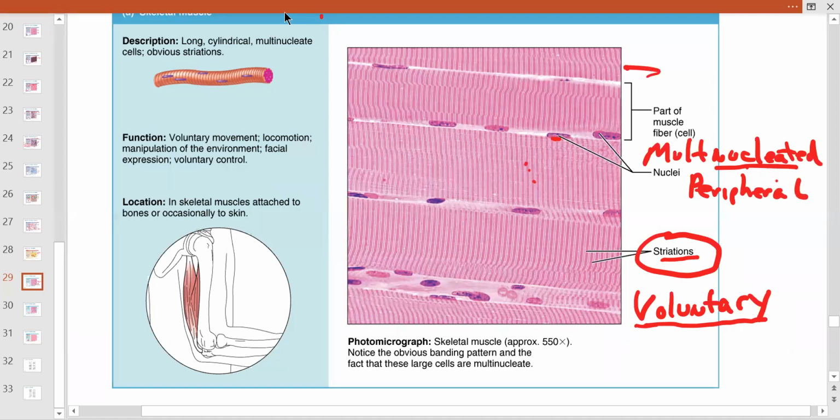So all of this is a muscle cell, with all the striations. If they're all bundled together, that's the way it works. This is the triceps brachii muscle in the back of the arm. So it has a tendon, and then you have all that contractile skeletal muscle tissue there.